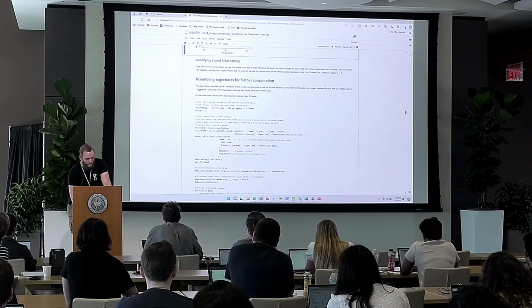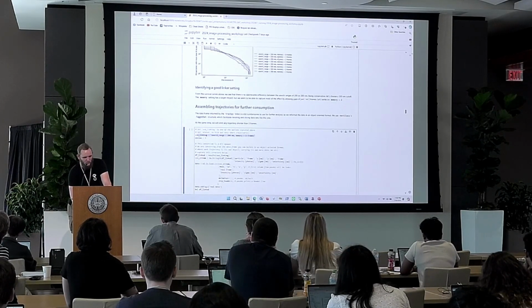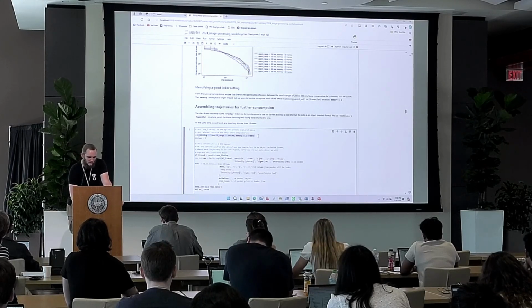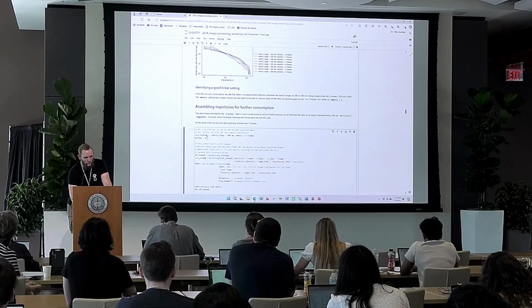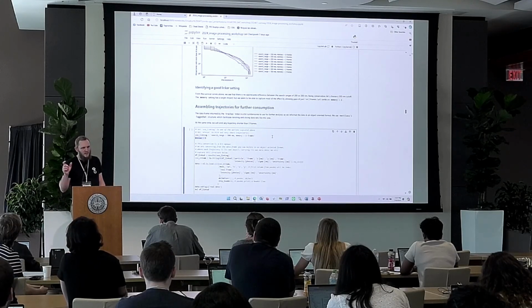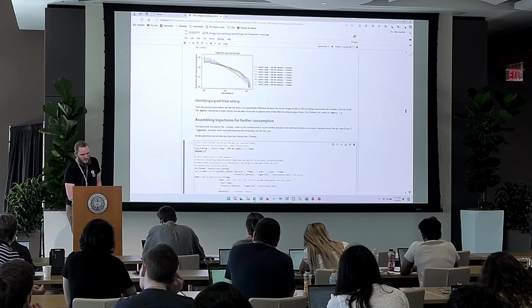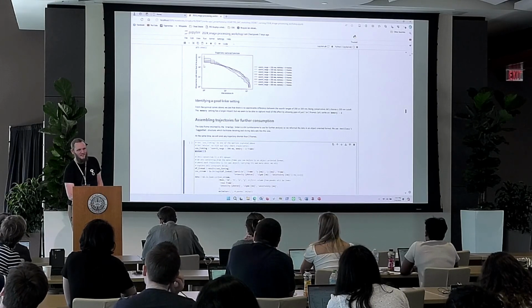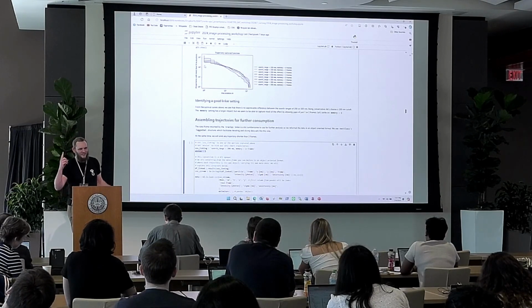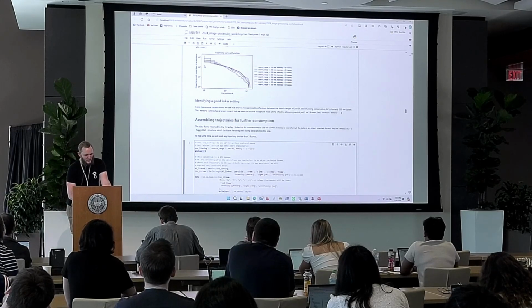So let's do that. In this next code block, I have this variable use linking where I identify which of these settings I want to use. You can choose whichever one you're happy with. This is the one I will use. And then we also restrict trajectories to have a minimum of 3 localizations. Everything shorter than that is just random noise popping up somewhere. And you can see from these survival curves that we do have a fair number of those. The first data point here are trajectories with a single localization, which means it's one localization that never came close enough to anything else to be linked into a trajectory. We're just going to kick those out. That's noise.